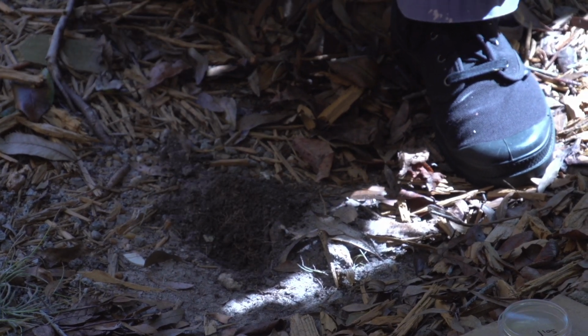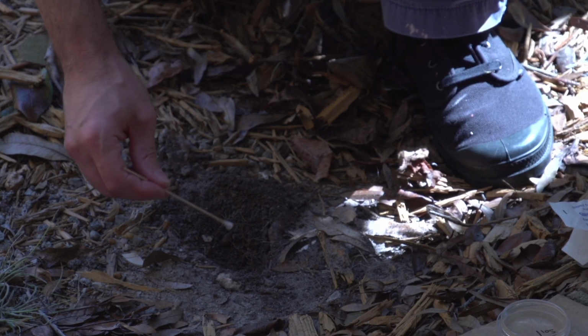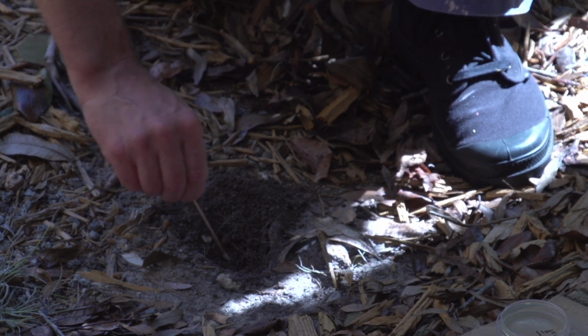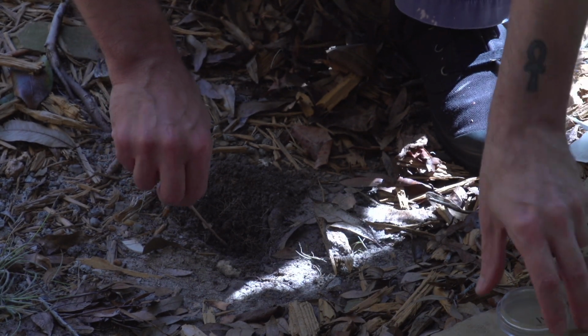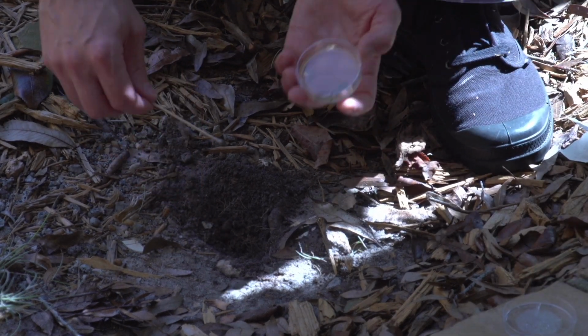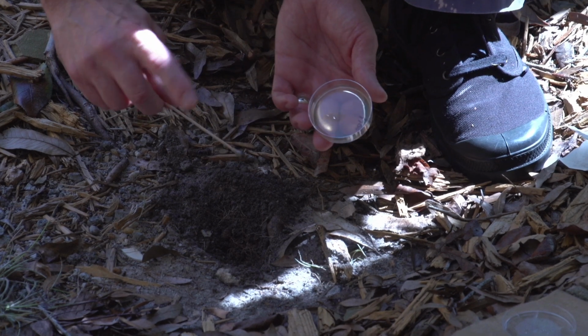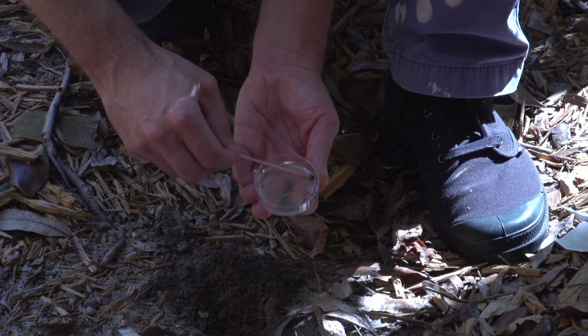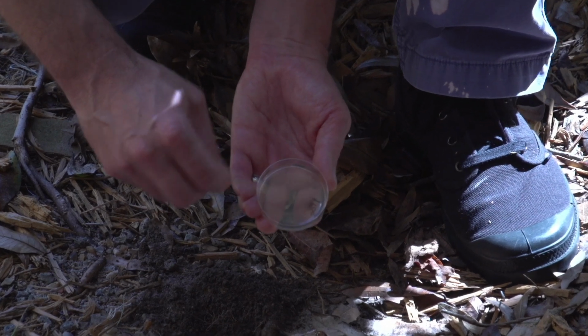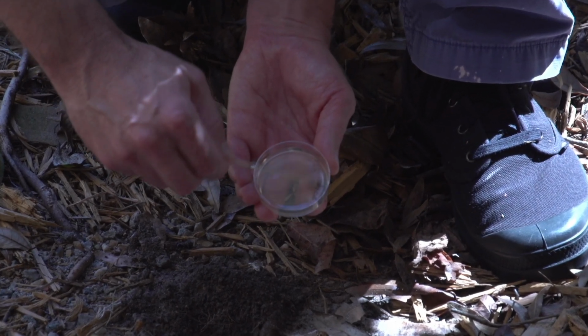Okay, so now I'm going to put it in. Cover the swab, and then basically what we need to do, just like we did on the others, is tap off some of that soil where we've got quadrant 1, and I'm twirling this around.